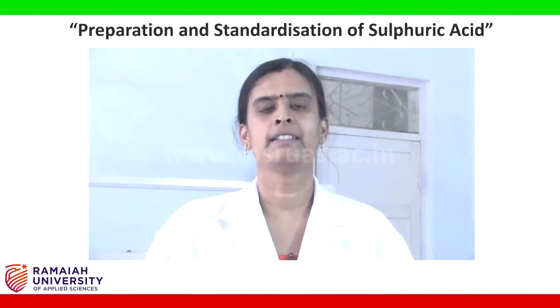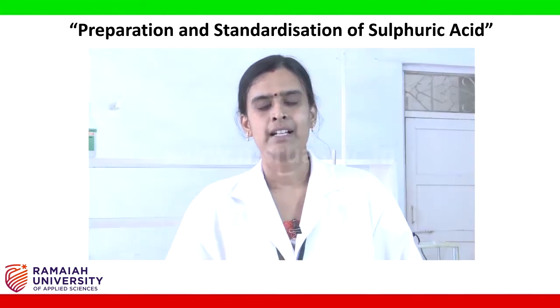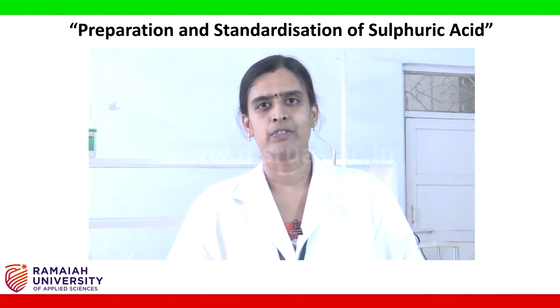Hi students, the name of the experiment is Standardization of 0.1 normal sulfuric acid. The aim of the experiment is to determine the exact strength of the given 0.1 normal sulfuric acid solution. Standardization of sulfuric acid is based on acid-base titration. Sulfuric acid is a secondary standard and it is standardized using anhydrous sodium carbonate as a primary standard. The indicator used here is methyl orange.